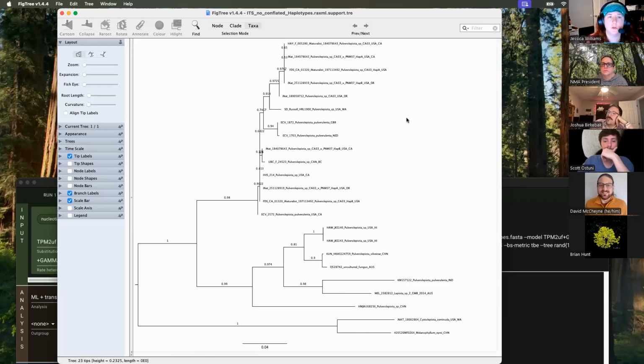I don't think you can salvage it manually unless you really want to. The forward had one frame shift, but the reverse had at least two. When I realized there was a second frame shift, I thought, I can't fix this. I've manually unshifted a bunch of chromatograms in my day, where your brain is thinking about the shadow hump and ignoring it. But at a certain point you might hit that second frame shift, and then I can't think in both one and two humps.